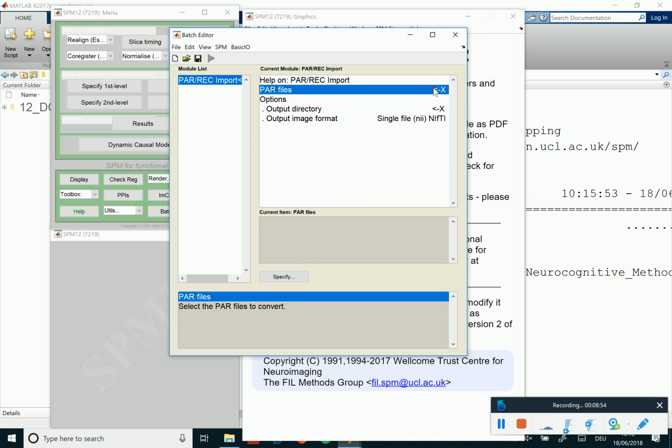And this then looks like this in this X. That means you need to specify something. This whole GUI thing is a little bit annoying, and it's weird, and I hardly use it. So right click sometimes is helpful if you want to delete things. That's something to know, and otherwise it's just a weird GUI interface.